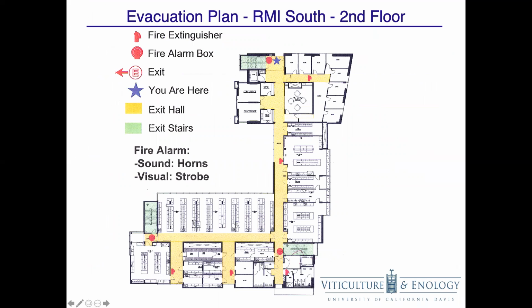Here's an example of the building evacuation plan. These are posted at the entryway to each lab. This details where the exits, fire alarm boxes, and fire extinguishers are.